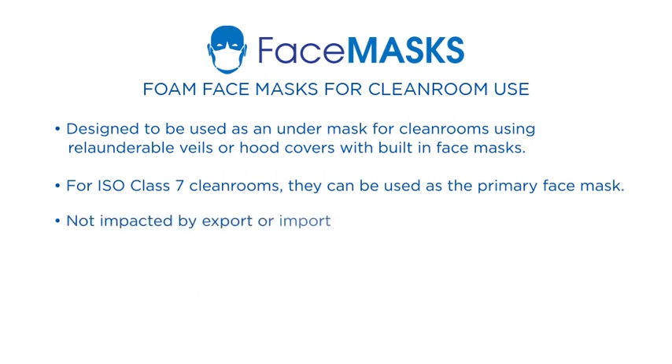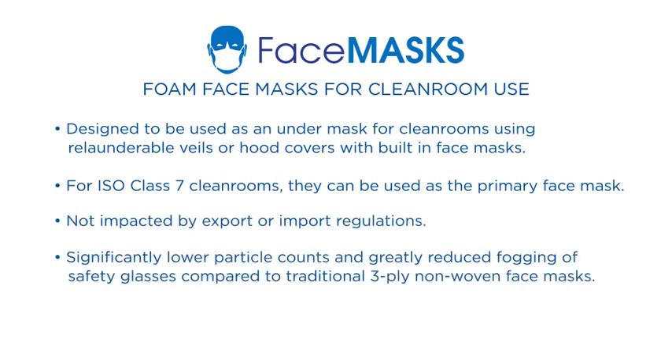They are not impacted by export or import regulations. They offer lower particle counts and reduced fogging compared to traditional 3-ply nonwoven face masks, and they are also fiber-free.